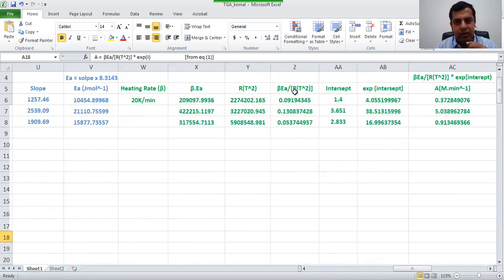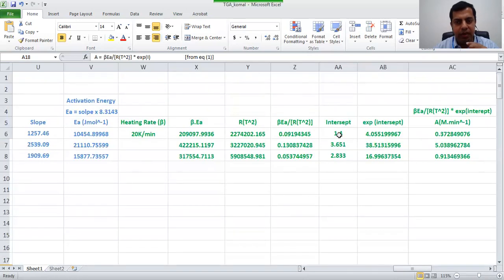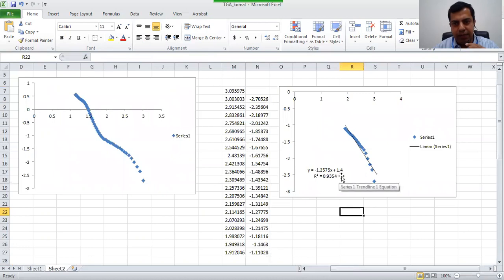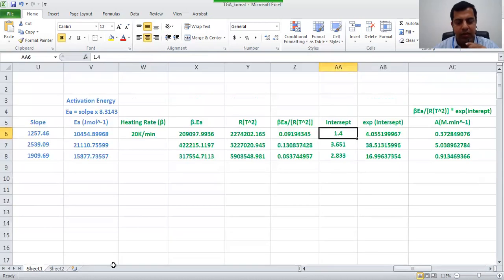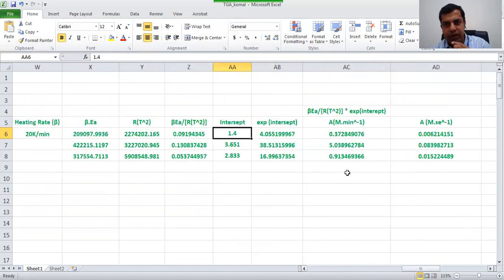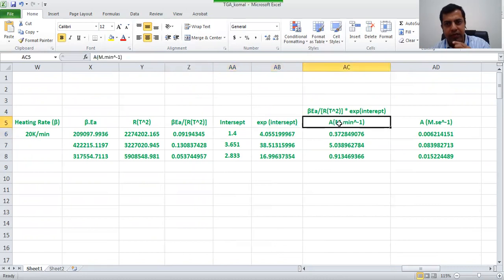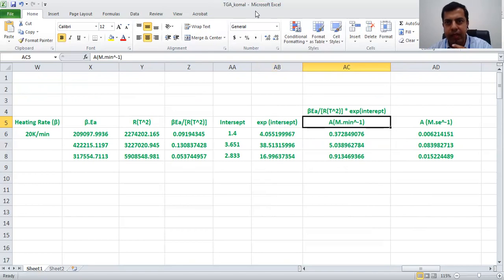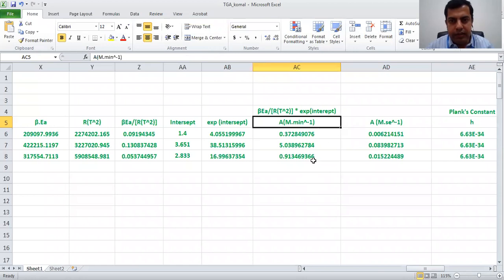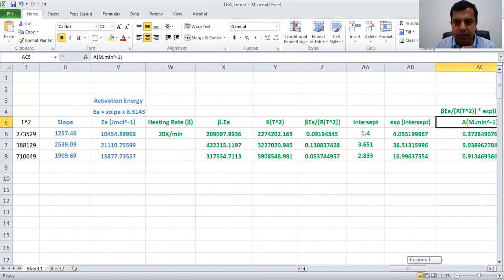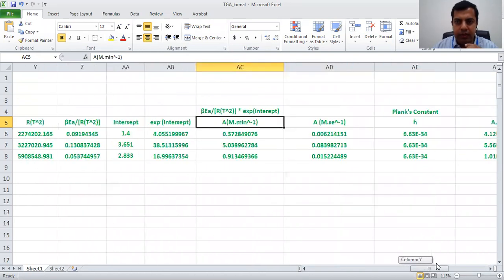So the intercept from the graph for phase one is 1.4. When you take the anti-log natural of 1.4 this gives you the corresponding value. According to the equation you then multiply this with the beta×Ea/RT² term, and that gives you the pre-exponential factor A. All these steps show how to calculate the pre-exponential factor. Note this value is per minute because time was taken in minutes, so next you convert it to per second.